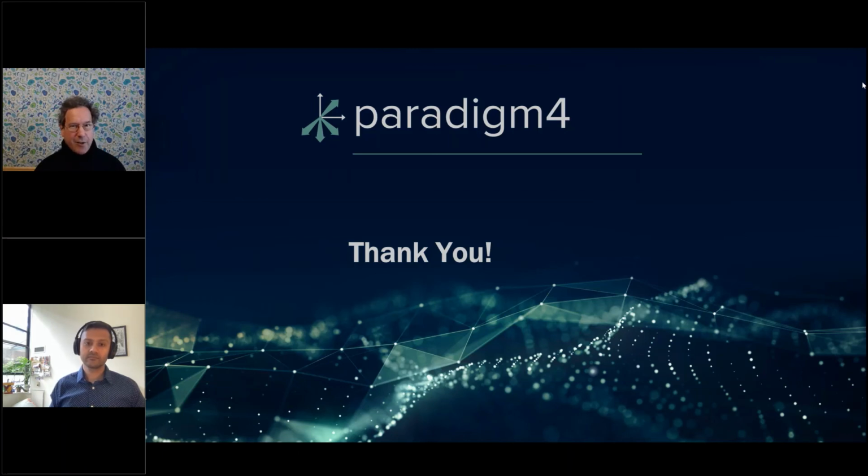I think it was Mike Kress who gave a talk about 3 years ago at Rahway, when the Allotrope meeting was there, who really outlined the grand vision of being able to have access to years of data in order to do the simulations and be able to identify essentially hidden critical quality attributes that are necessary in order to reduce OOS and OOT.